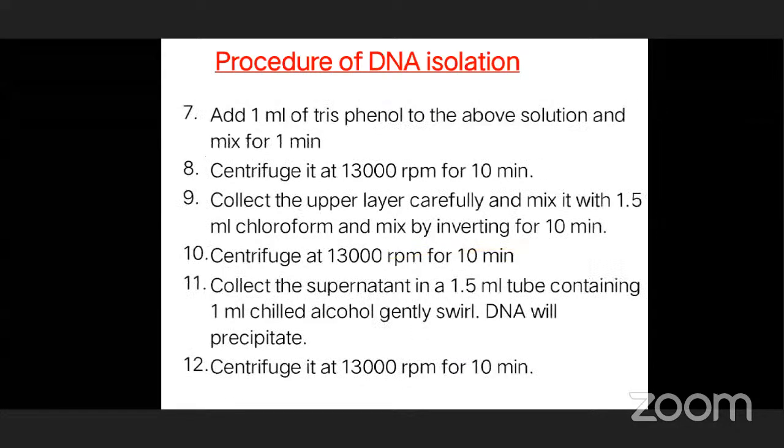Then, next step, add 1 ml of tris phenol solution to the above solution and mix for 1 minute. Then centrifuge at high speed, 13,000 rotations per minute, for 10 minutes. Then collect the upper layer carefully and mix with 1.5 ml chloroform, mixing by inverting for 10 minutes.